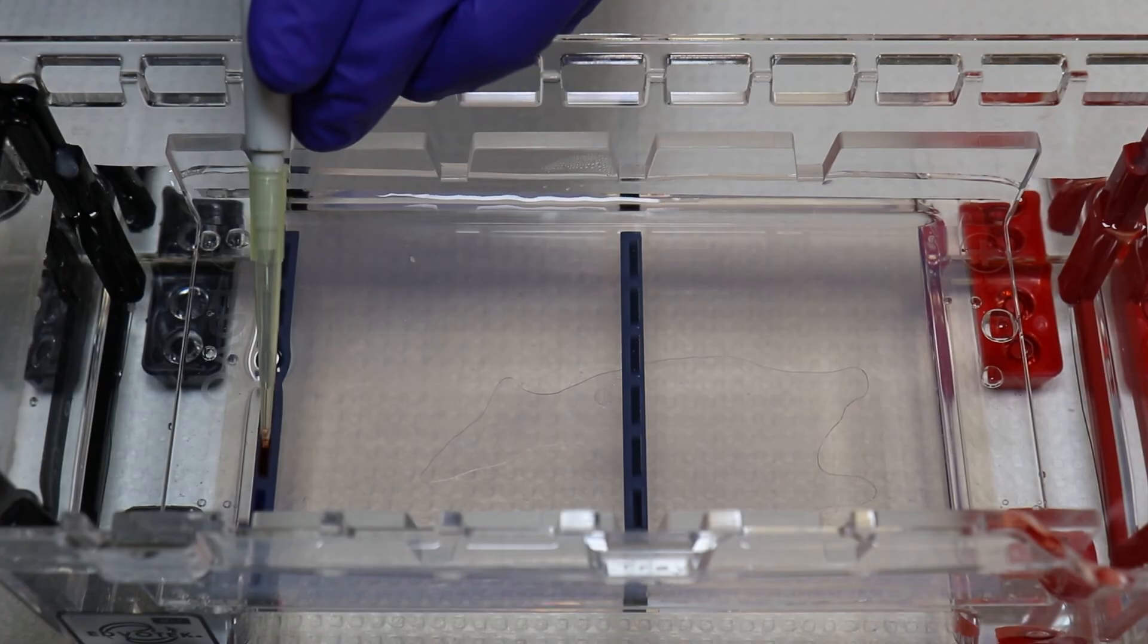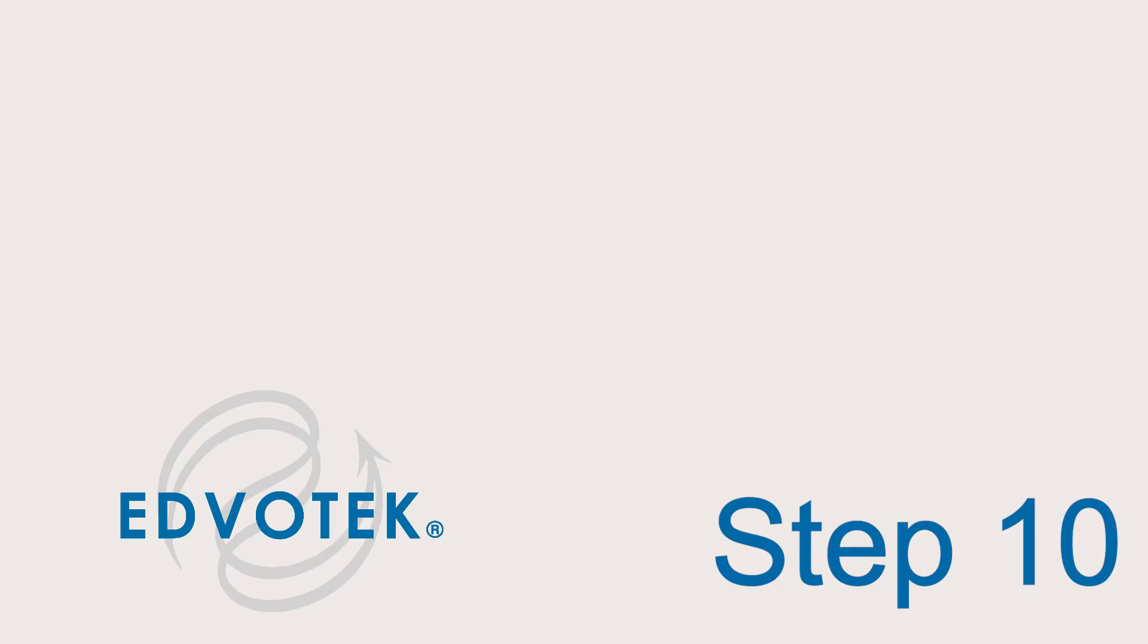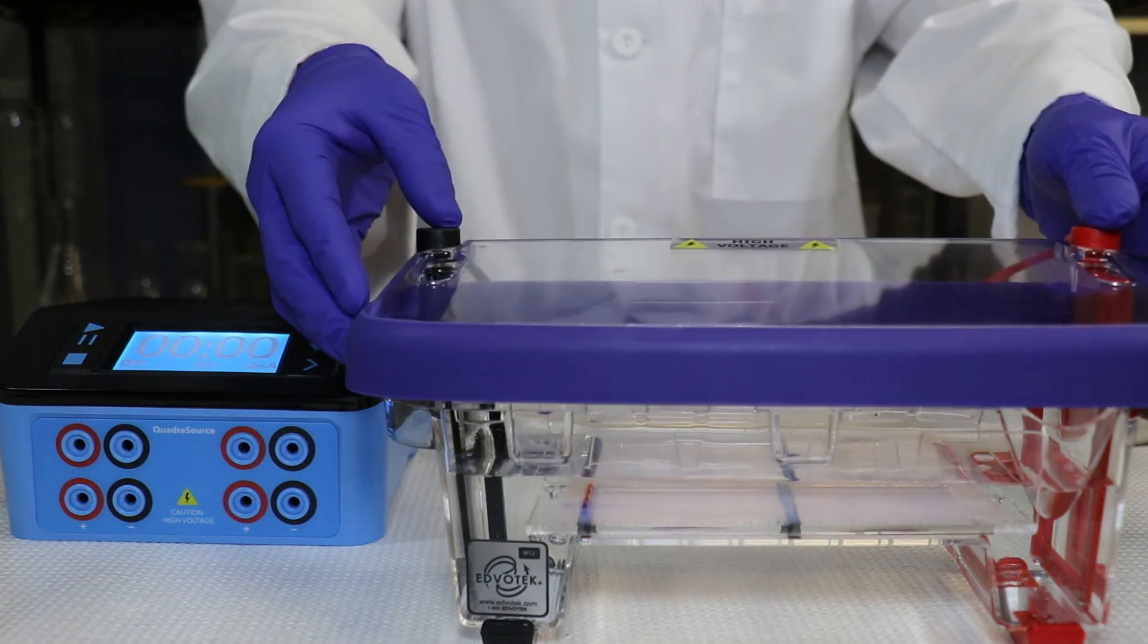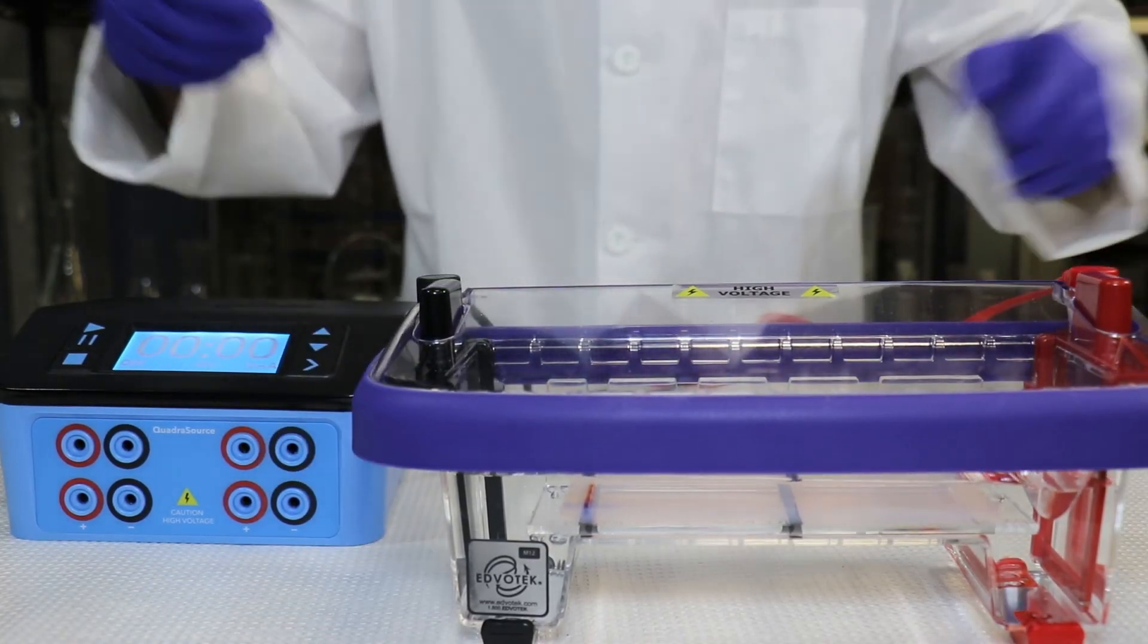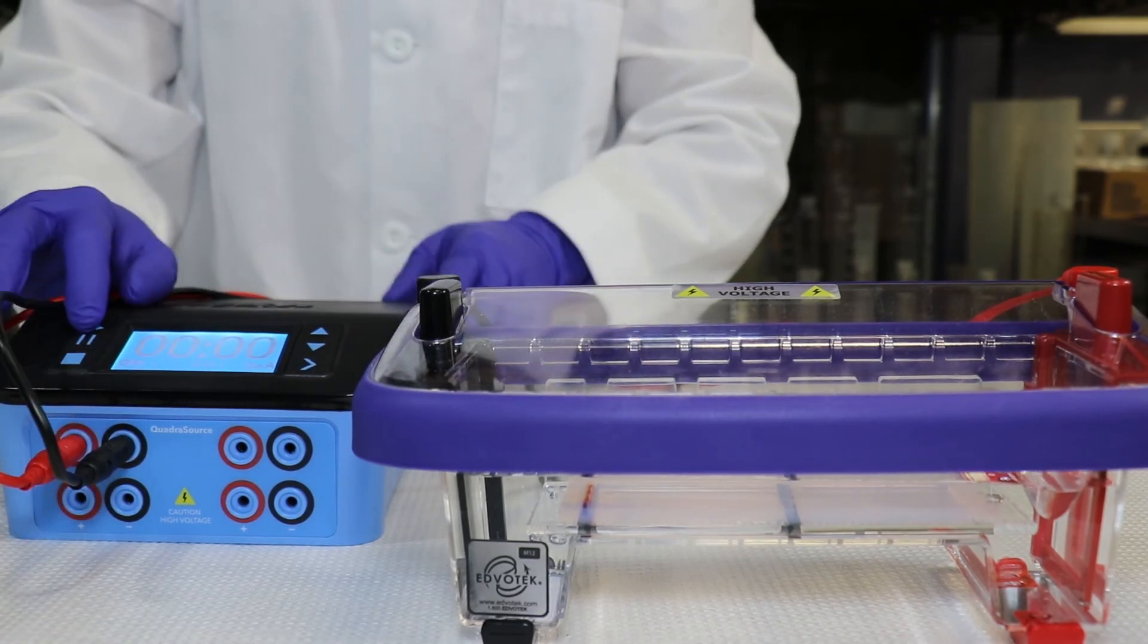Control DNA, undigested DNA, and digested DNA. Step 10: After all samples are loaded into the gel, check that the gel is properly oriented and then place the safety cover onto the chamber. Step 11: Connect the leads to the power supply and perform electrophoresis.